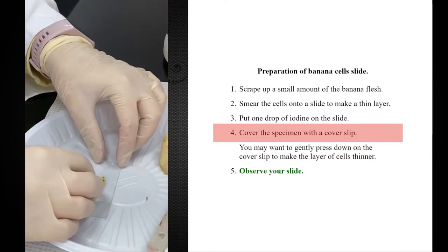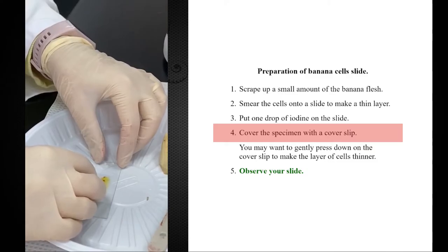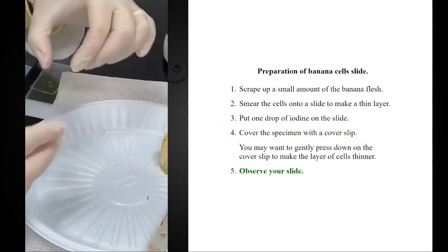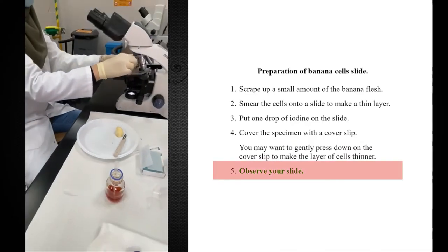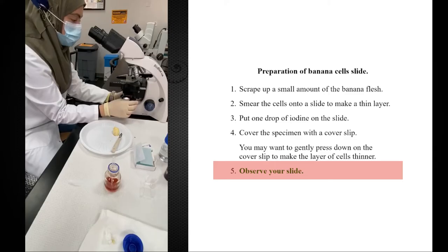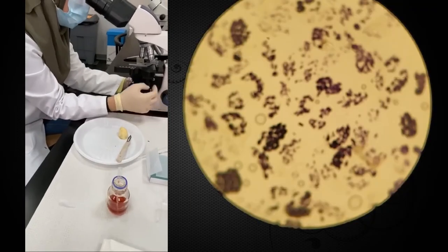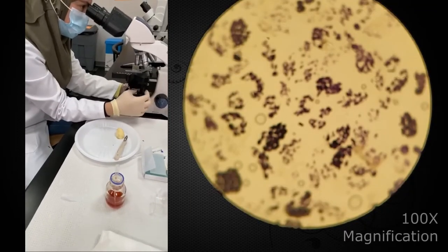And slowly cover the cells without catching air bubbles. The slide is ready. I start with the lowest magnification, stage all the way up, and then I lower until the cells are clear.